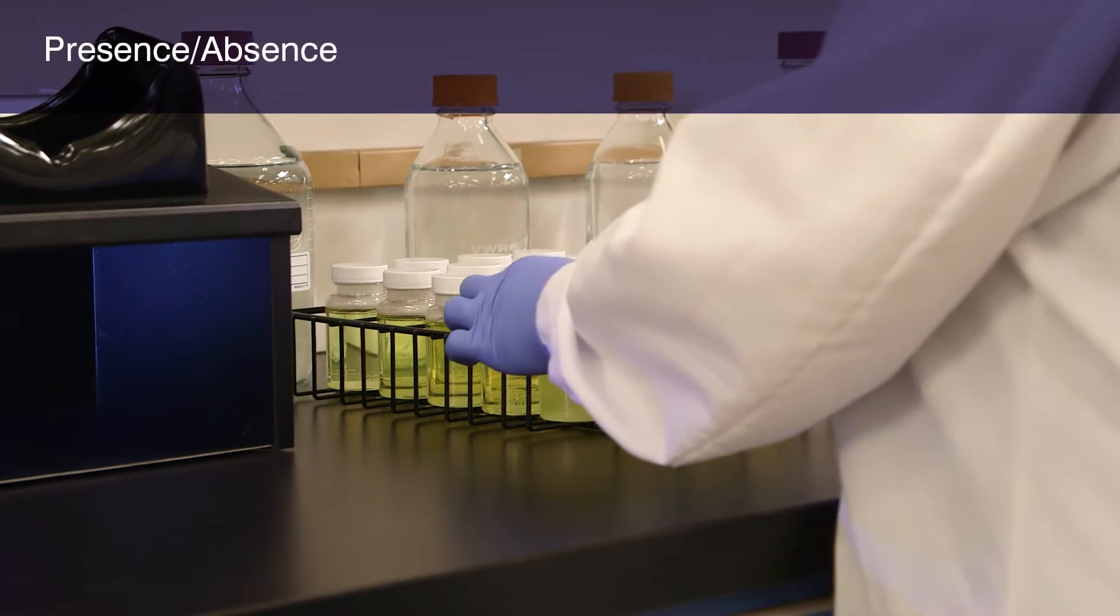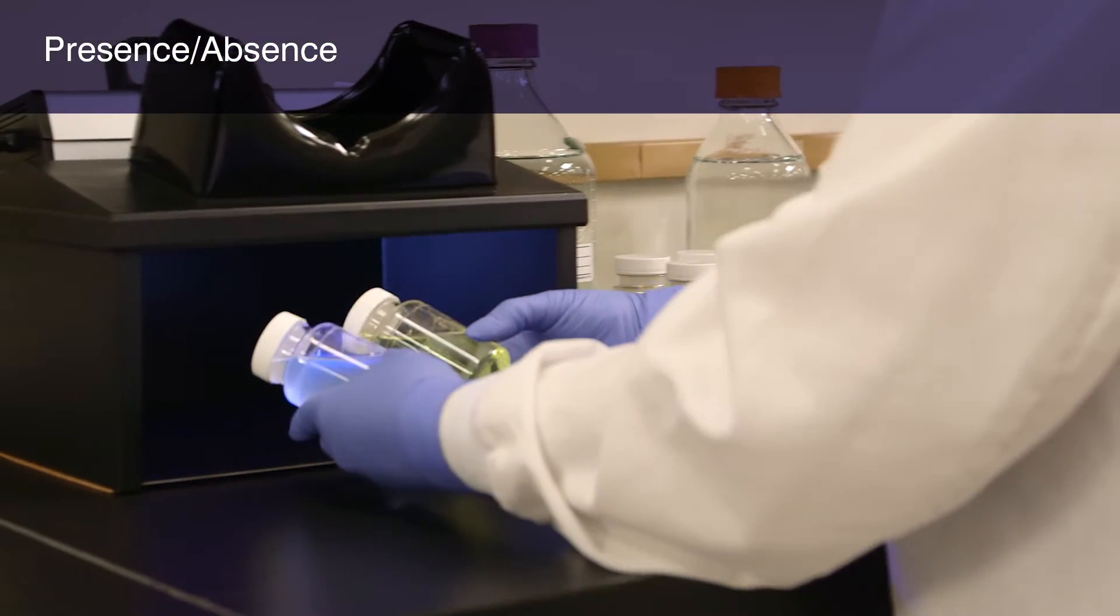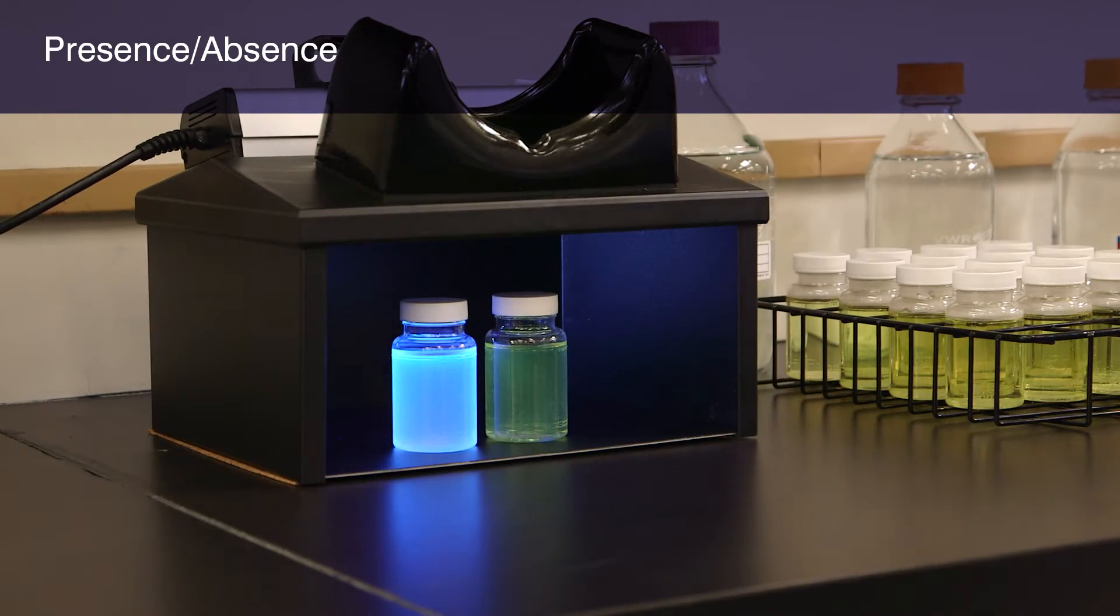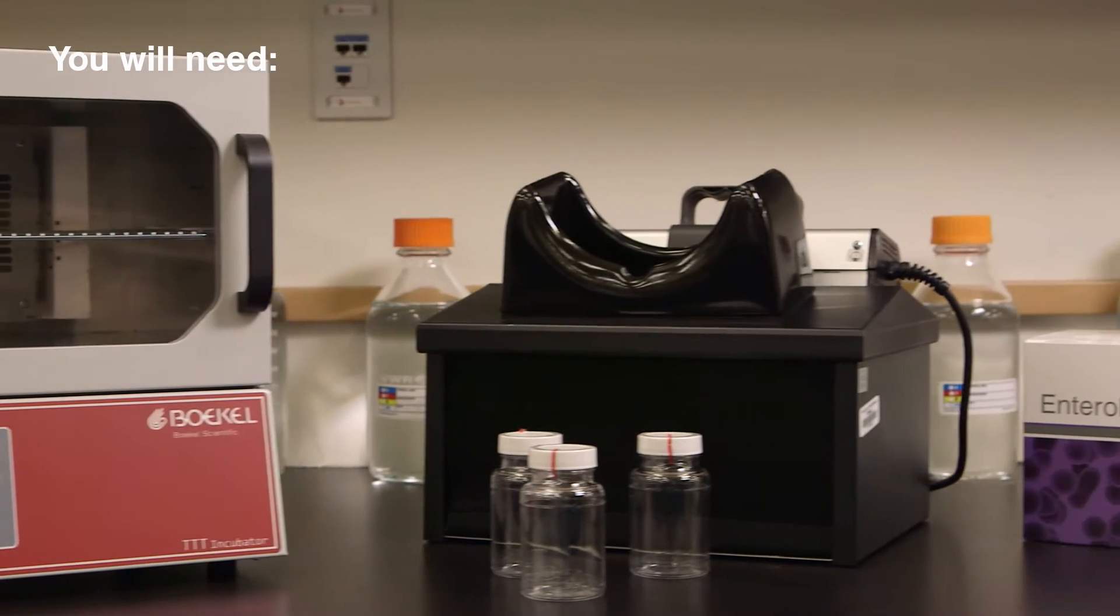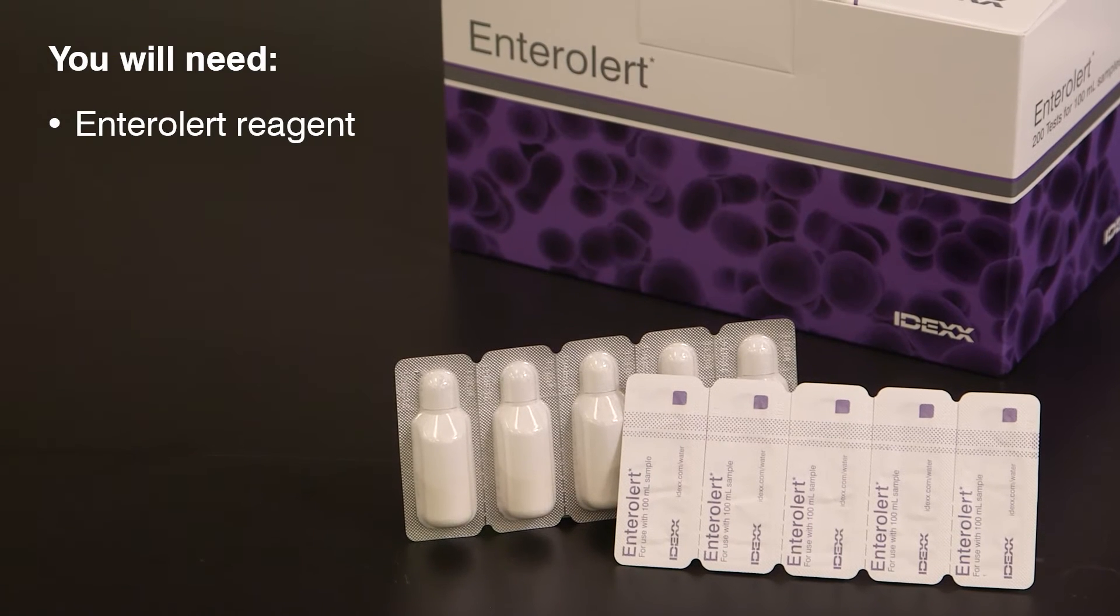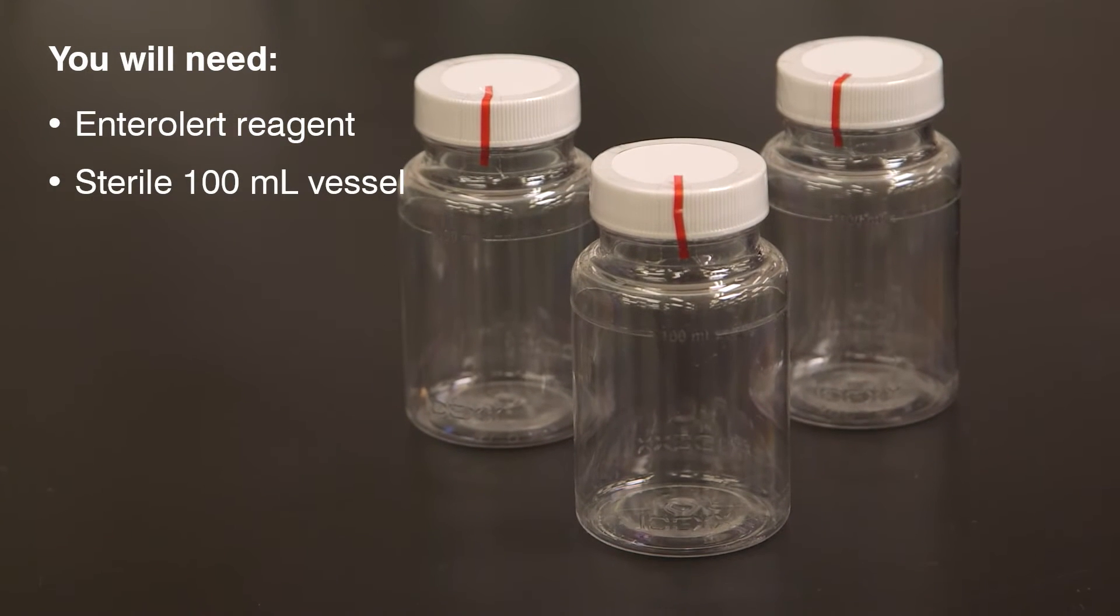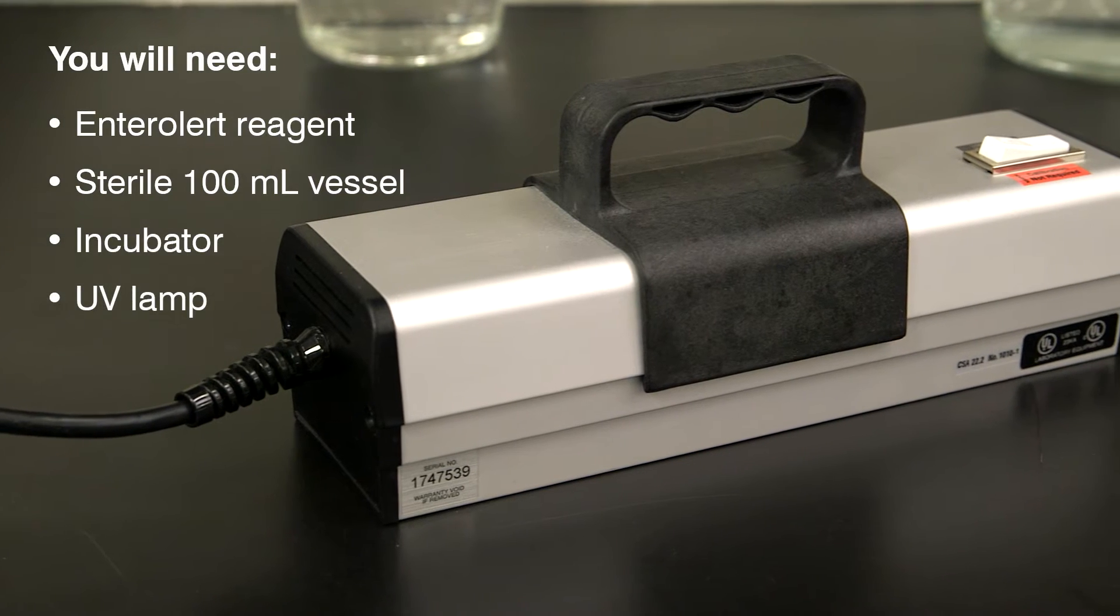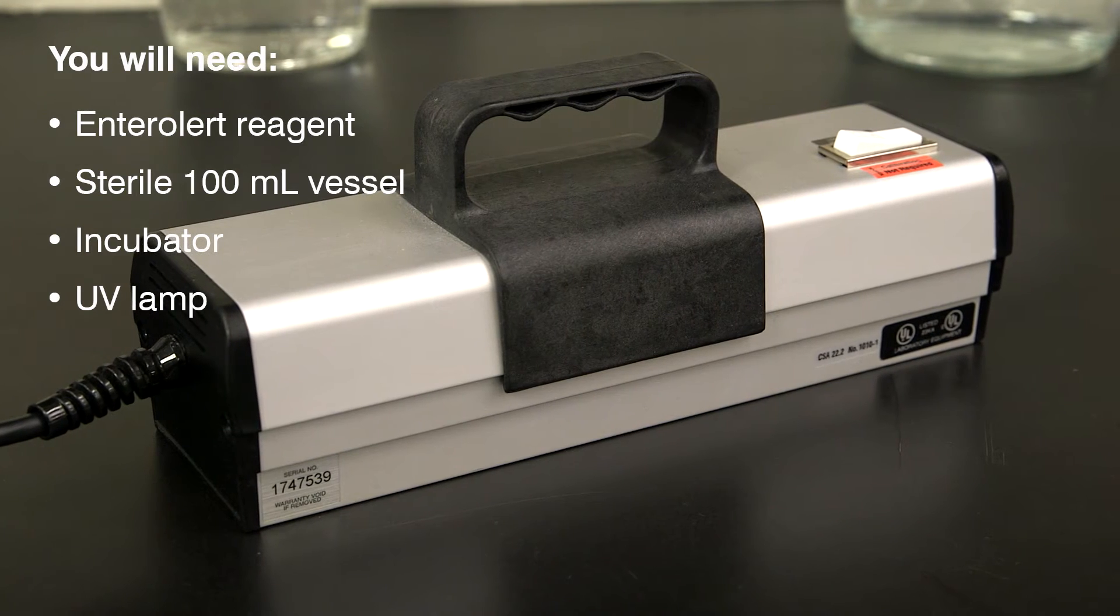In the first demonstration, you will learn how to use the Enteralert test for presence-absence detection of enterococci. You will need the Enteralert reagent, a sterile, transparent, non-fluorescent 100 ml vessel, a temperature-controlled incubator, and a 6-watt, 365-nanometer UV lamp.